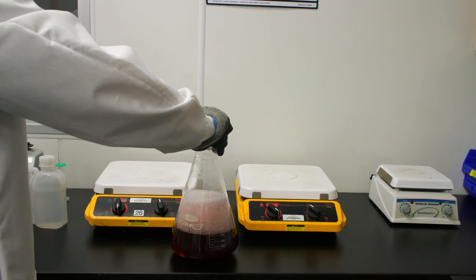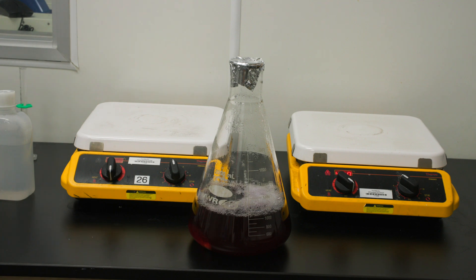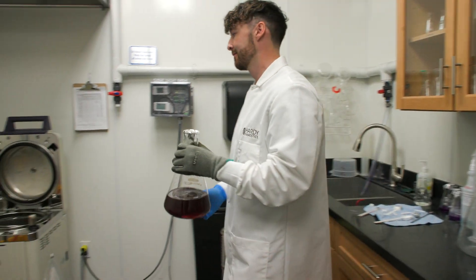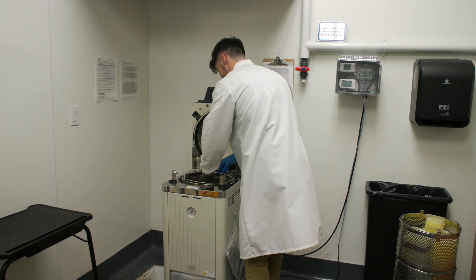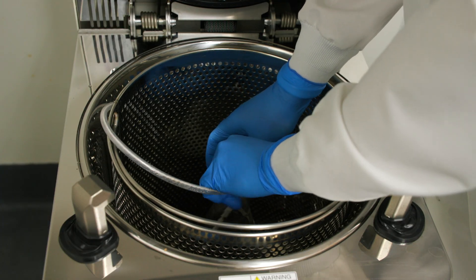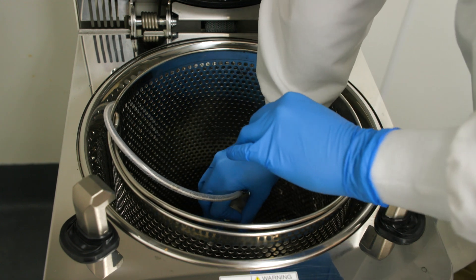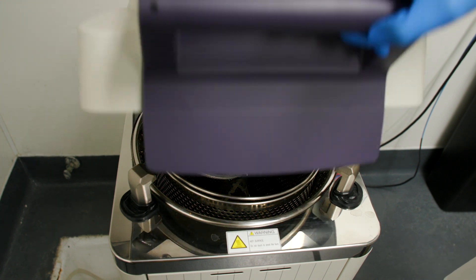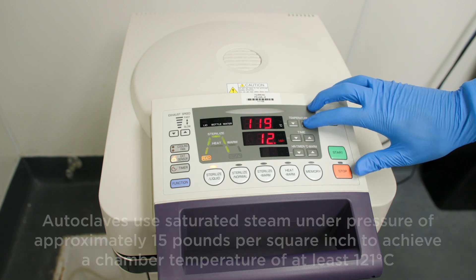Be sure to use heat-resistant gloves when handling the hot flask to avoid burns. Place the flask of boiling media into an autoclave to sterilize. If your autoclave is equipped with a temperature probe, the probe can be placed directly into the media and the cycle parameters will be based on the readings of the probe. Set the autoclave to 121 degrees Celsius for 15 minutes. Avoid overheating.